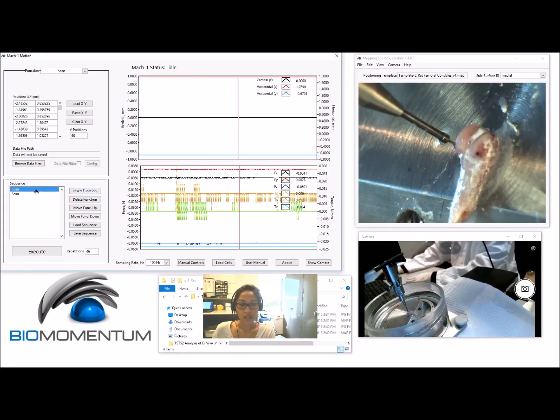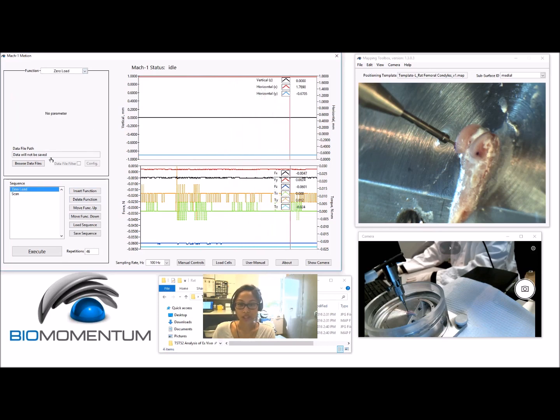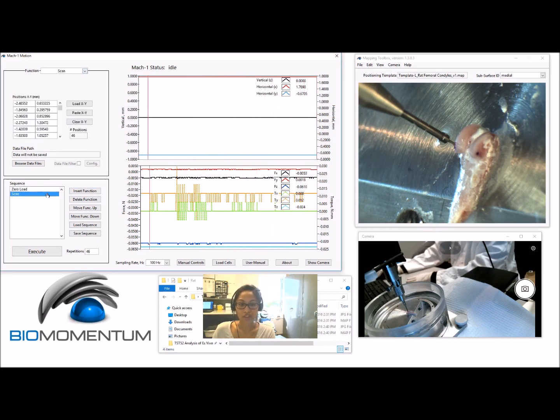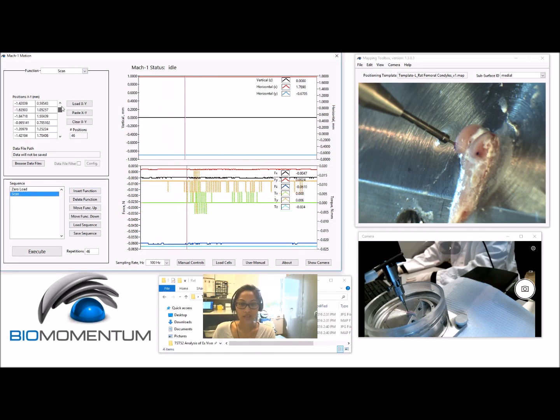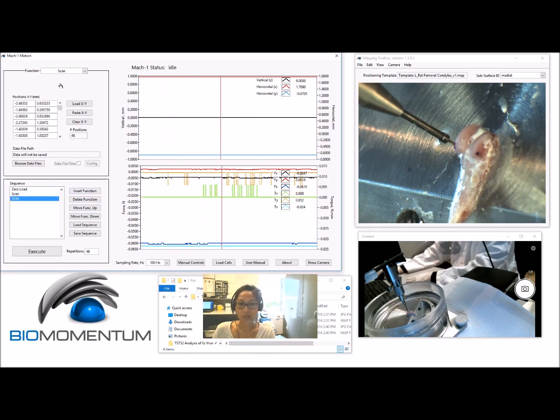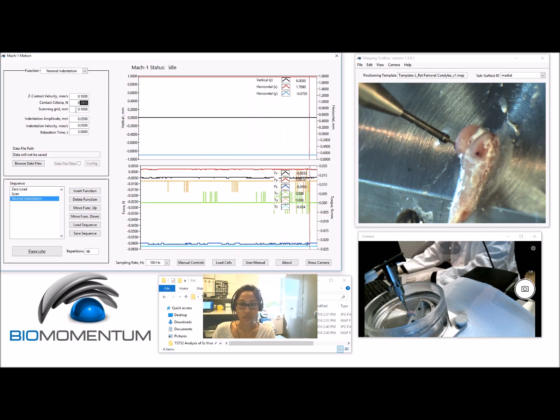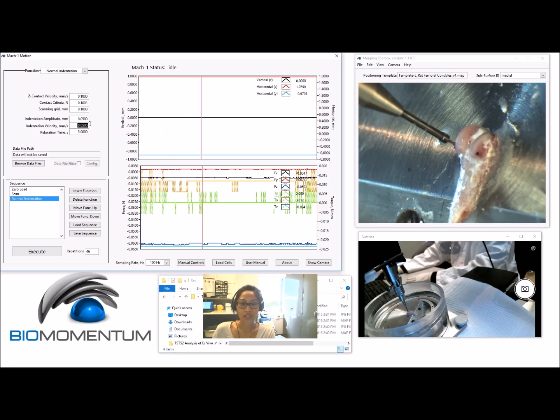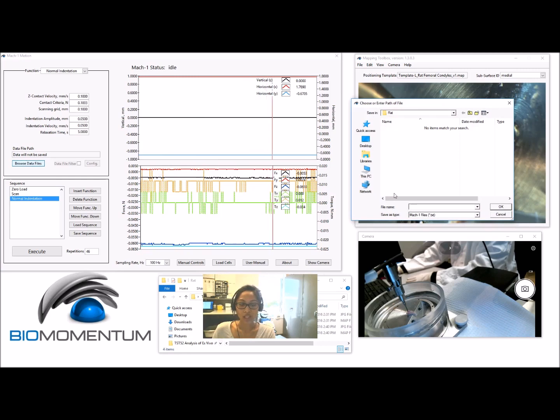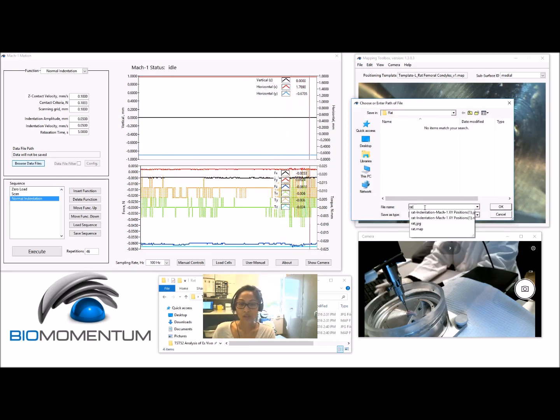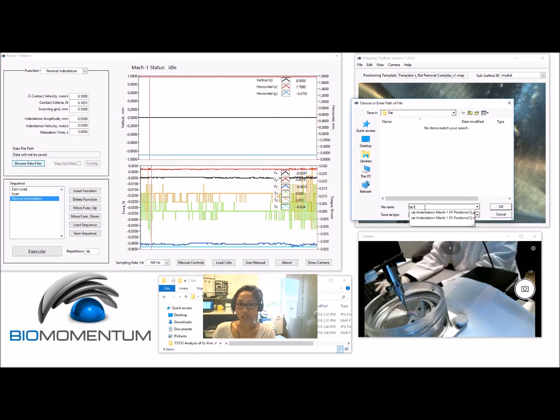Create the following sequence for the automated indentation mapping: add a zero load function, followed by a scan function with the previously copied position coordinates, then add a normal indentation function where the parameters are specific to each sample type. Don't forget to save the data from the normal indentation function.